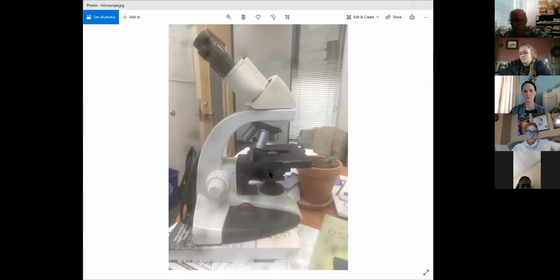Although they're an important part of the diaphragm, it is also helping with focusing, because there's an optical property that the smaller the opening you look through, the greater what's called the depth of field. When you look at something, and you're focusing on something with your eyes, that thing is in focus, right? There's a certain amount of stuff in front of that object that's in focus, and a certain amount of stuff behind that that's in focus. And the rest is a soft blur. That's called depth of field. And the smaller the opening you look through, the greater the depth of field.